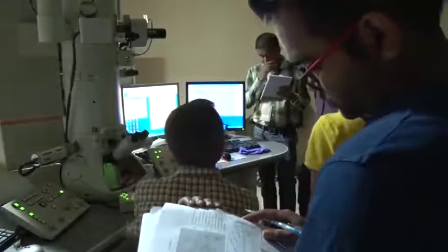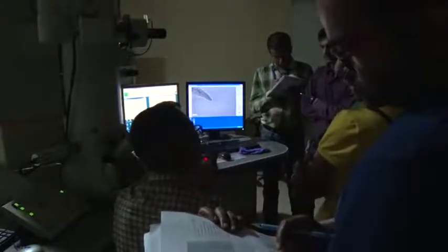So now, unless you change the objective lens current, it is not dependent on the sample at all. That is, when you change the focus of the objective lens, then it will change. Since he has asked the question, let me clarify. The process of focusing the sample is like this: we set the objective lens current to the standard value, and ideally one should never have to change that objective lens current, because that's what we said, we'll keep it fixed. That's our reference. Yeah, you are right. I'll explain your issue also.